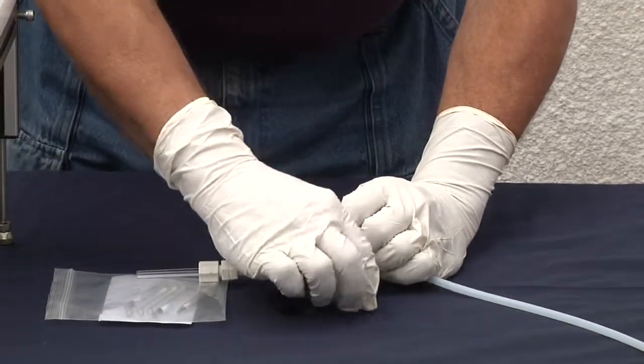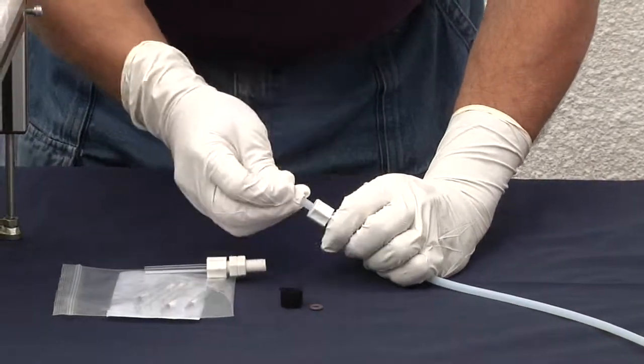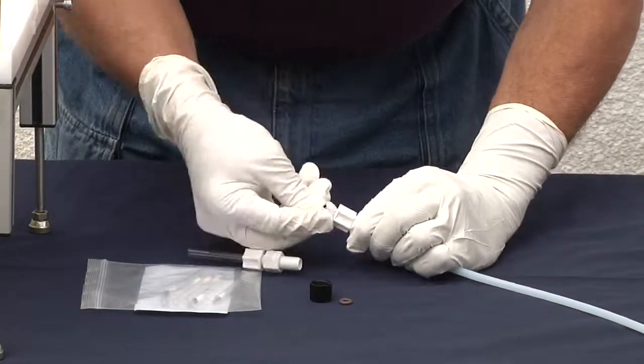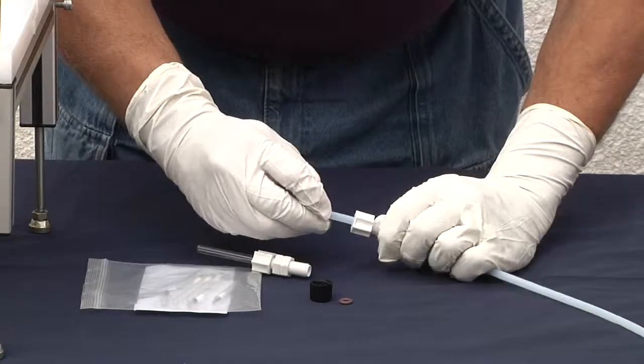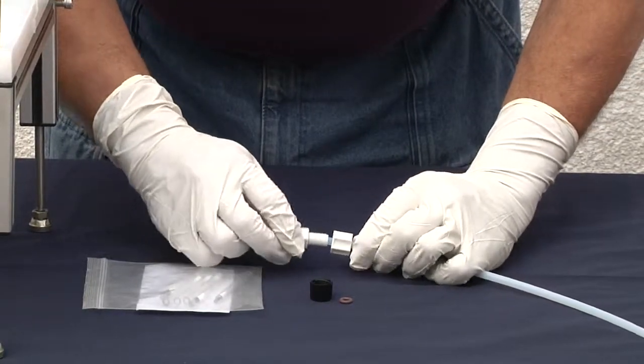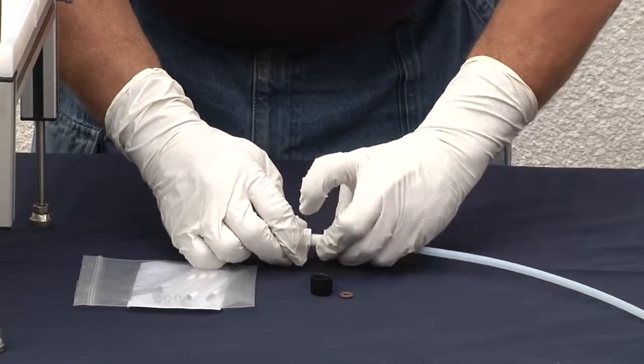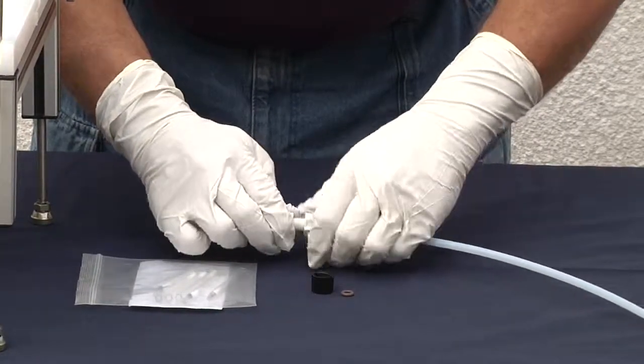On our tubing we put on our o-ring, pushing that forward until our tubing connects with the small end of the VCT making sure that we have a good seal.